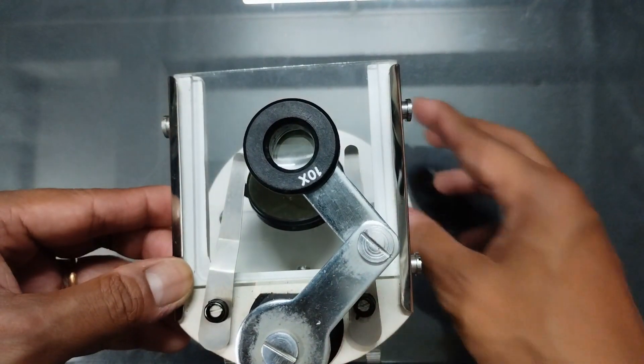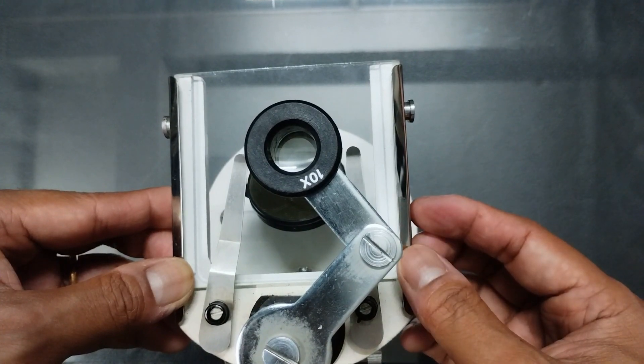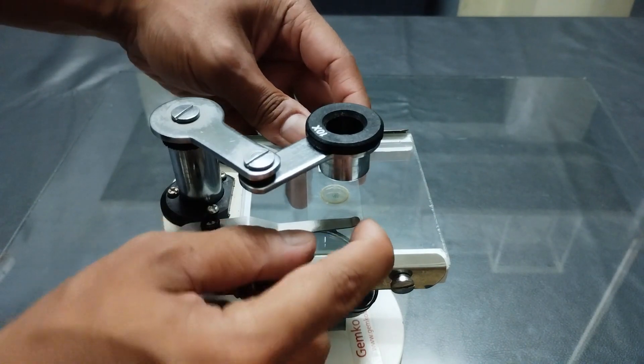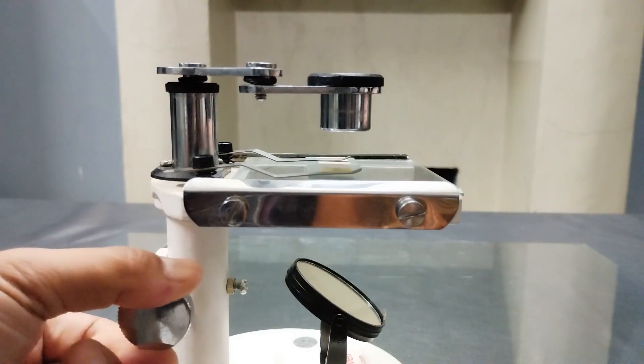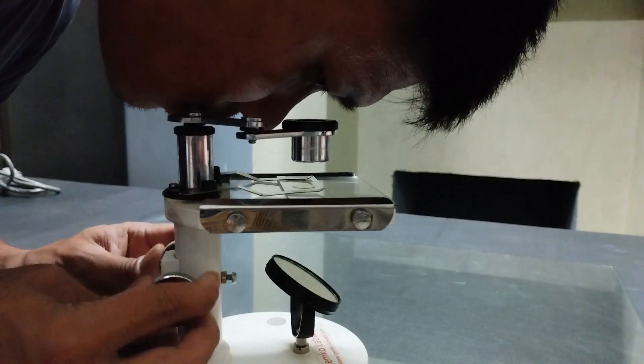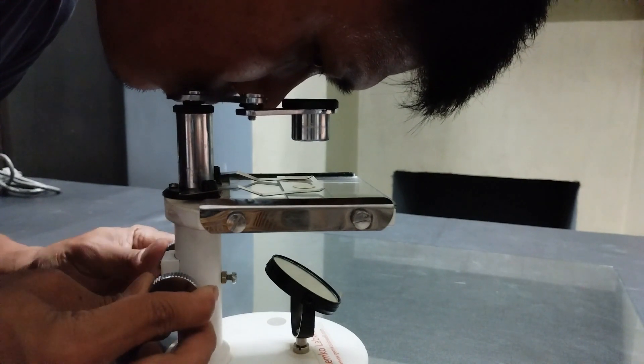Now, if the specimen is of a transparent nature and you want to use transmitted light to view it, simply place the specimen right beneath the eye lens. Using the adjustment screw, lower the lens to its maximum or until it almost touches the specimen surface. Then look through the lens and gradually lift it up using the screw until the specimen comes into clear focus. Observe and study.